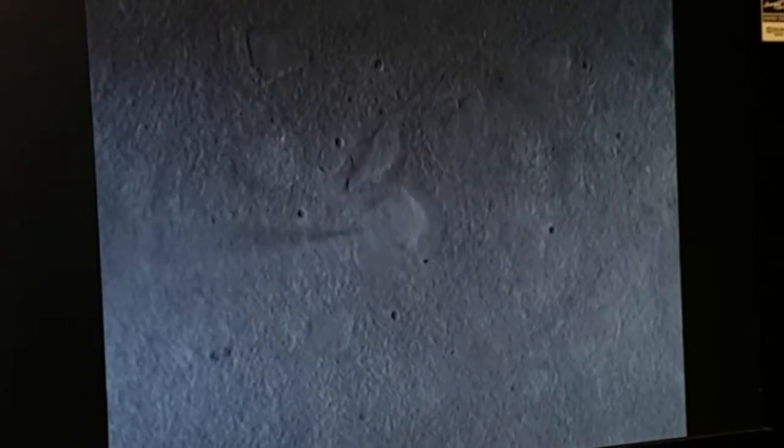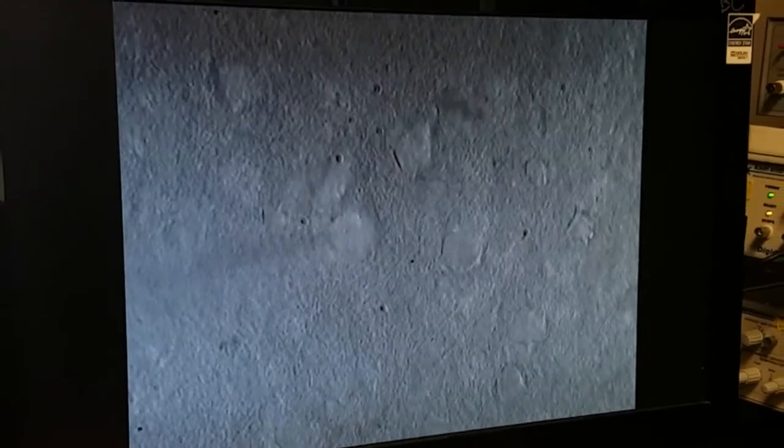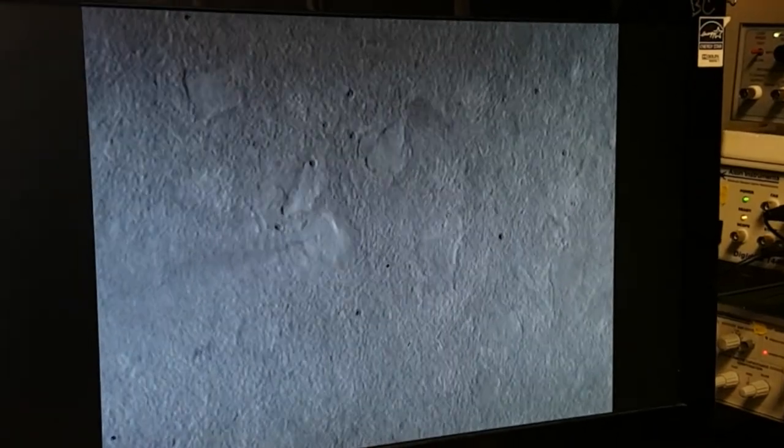Using the micromanipulator at medium speed, descend the recording pipette to the region of interest. Then, switch to slow, and bring the recording pipette down towards the surface of the desired neuron, switching between the focus of the cell and the tip. Once your pipette tip is close enough, you may notice a slight dimple forming on the surface of the membranes of the cell. This is due to the positive pressure of the pipette tip.